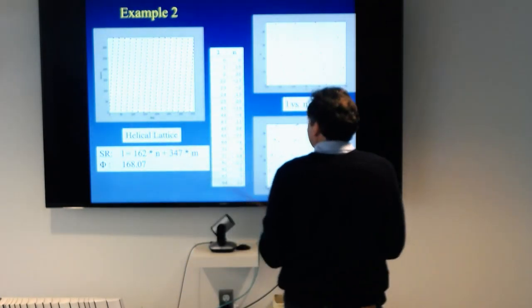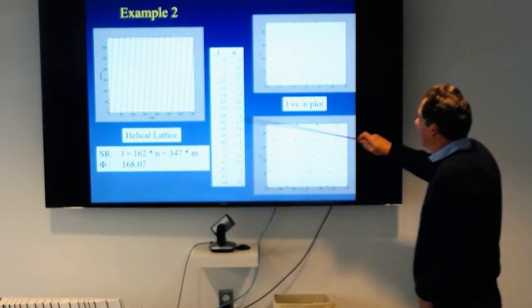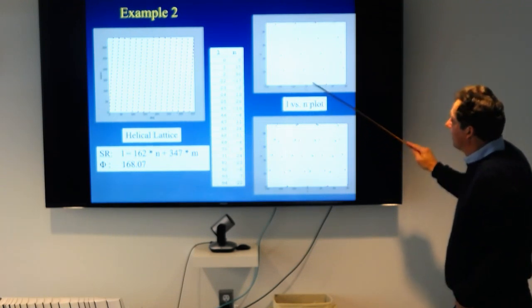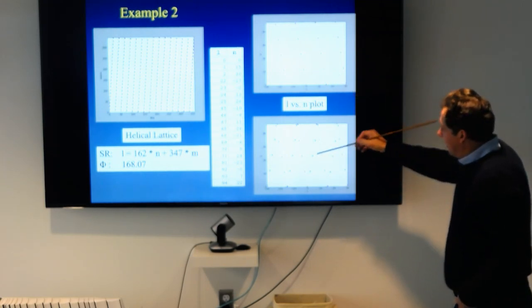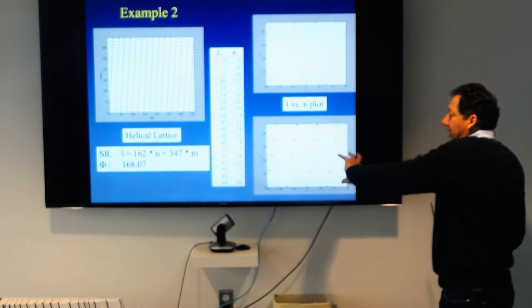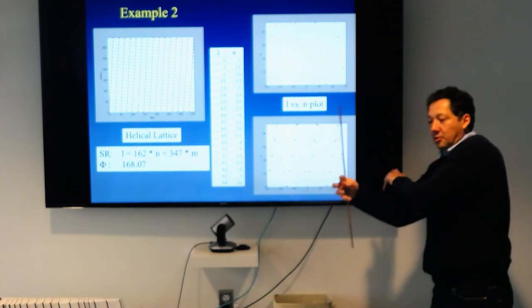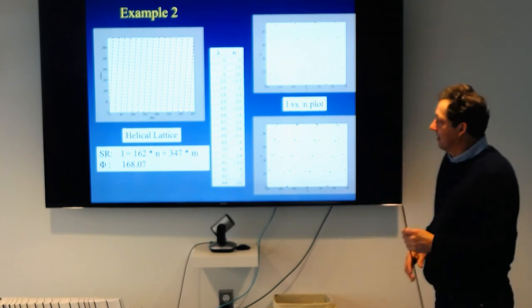This is another example. This is a microtubule, and this will be the L versus N plot. And in blue, I put the points that you would also expect from the lattice in the backside.